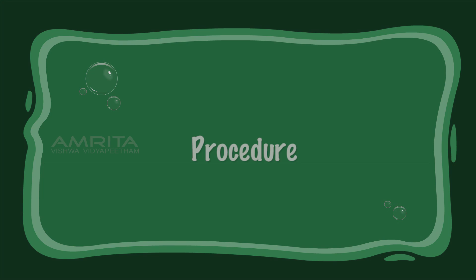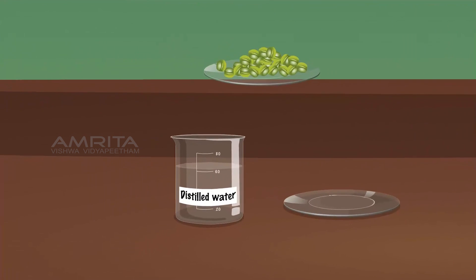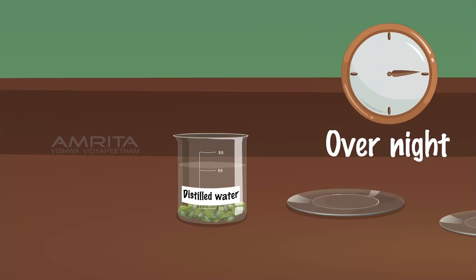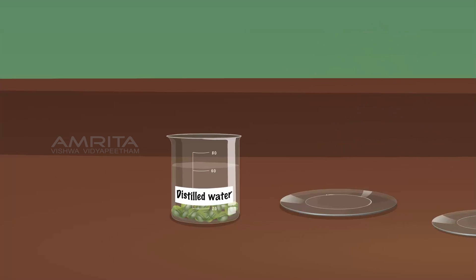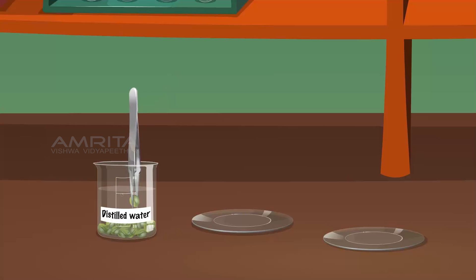Pea Seed. Procedure: Place a few pea seeds in a beaker containing distilled water. Soak the pea seeds overnight. Using a pair of forceps, pick one seed from the beaker and place it in a watch glass.